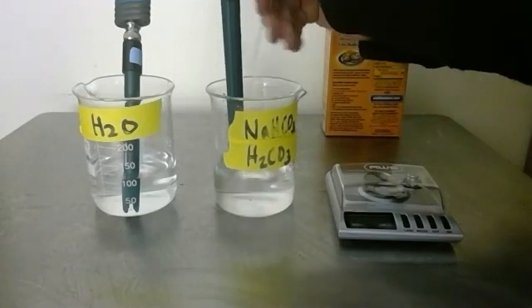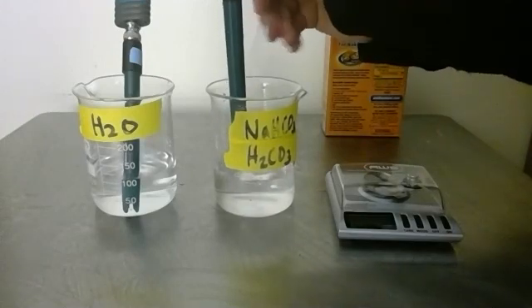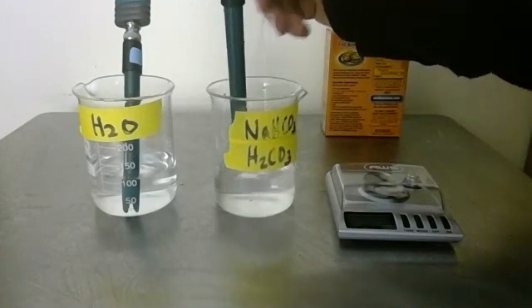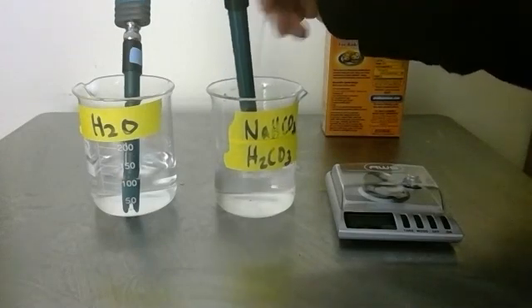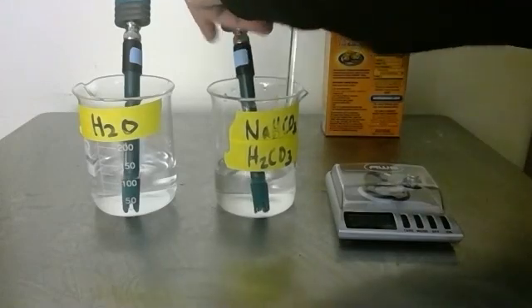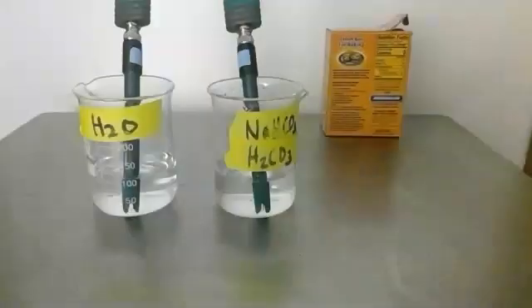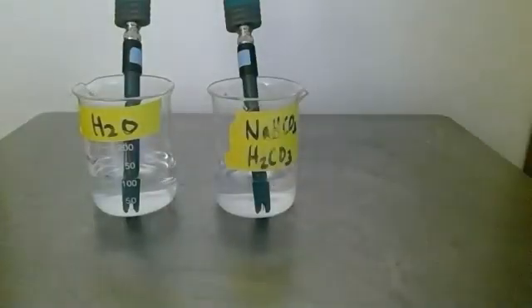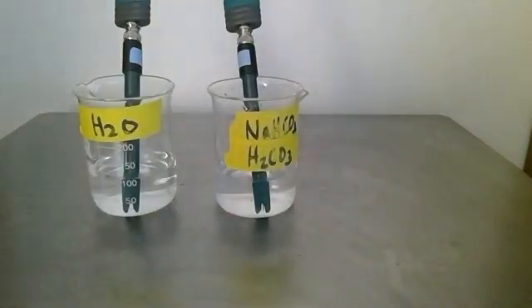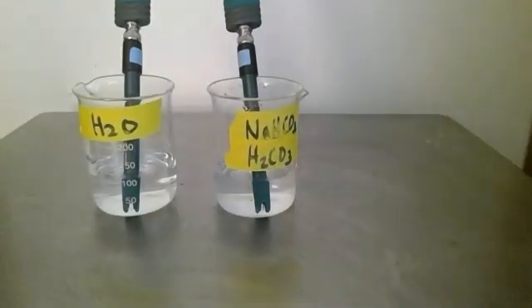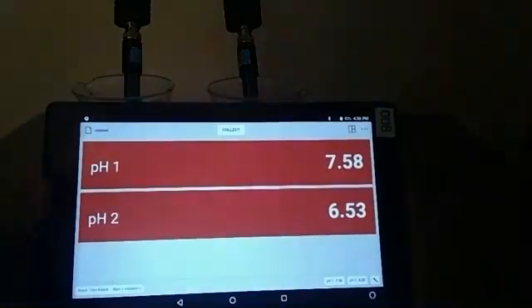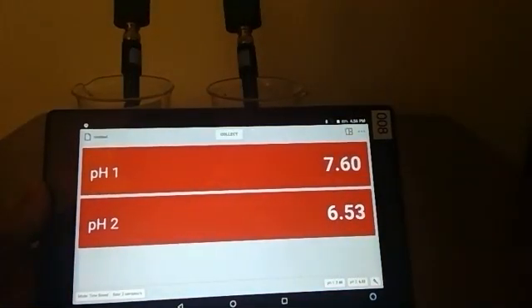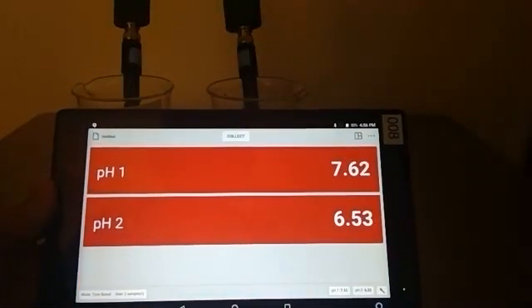Similarly, carbonic acid in water will slowly decompose to carbon dioxide, which is why we have to make it every single time. It doesn't store on a shelf. That is dissolved. Where this was at below six before, our buffer solution now has a pH of about 7.5, now 7.6.